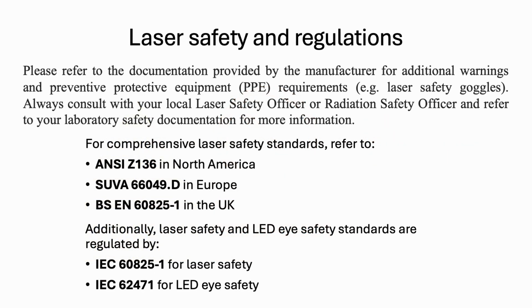Please refer to the documentation provided by the manufacturer for additional warnings and personal protective equipment (PPE) requirements, for example, laser safety goggles. Always consult with your local laser safety officer or radiation safety officer and refer to your laboratory safety documentation for more information. You can also consult your laser safety standards: ANSI Z136 in North America, SUVA 66049D in Europe, and BS EN 60825-1 in the UK. Additionally, laser safety standards and regulations are covered by IEC 60825-1, and LED eye safety standards and regulations are covered by IEC 62471 in Europe.